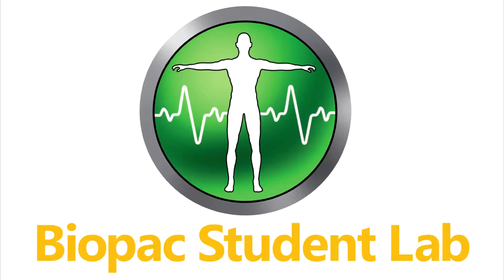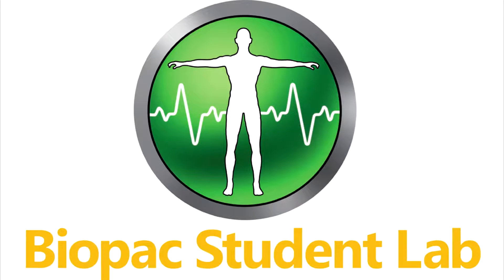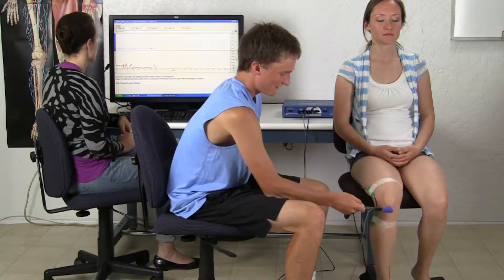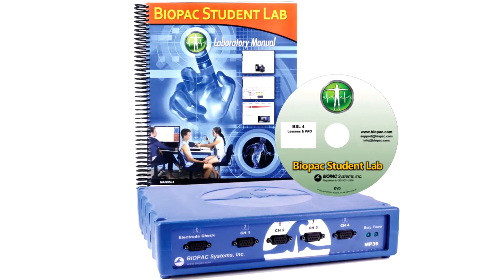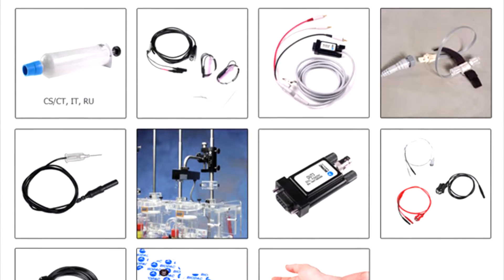The Biopac Student Lab is an integrated system of hardware, software, and curriculum used by thousands of labs worldwide at two-year, four-year, nursing and medical schools for undergraduate and graduate life science studies. This overview details the components included in the BSL Pharmacology and Toxicology System.